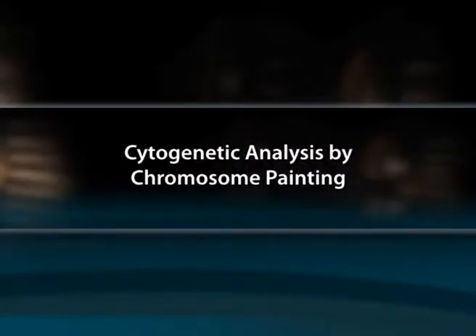Chromosome painting coupled with FISH is now used routinely to enhance the identification of chromosomal rearrangements, the assignment of breakpoints and the determination of the origin of extra chromosomal material. These technologies have enabled the development of reverse chromosome painting, in which the paint is produced from sorted aberrant chromosomes and hybridized back onto normal metaphase spreads to identify directly the composition of the aberrant chromosome. Cytogenetic analysis by chromosome painting.